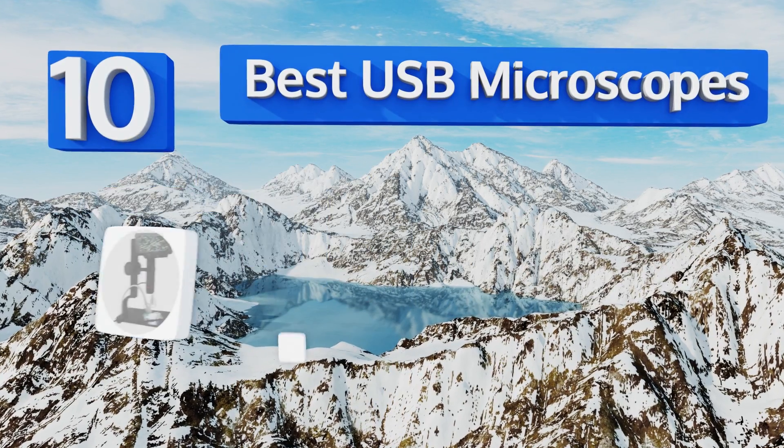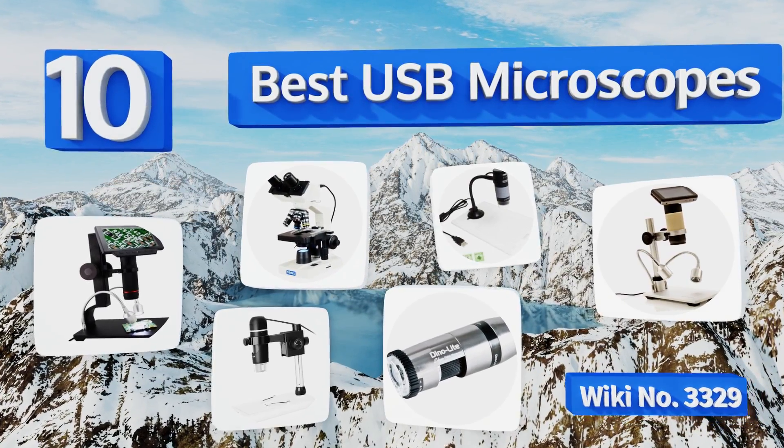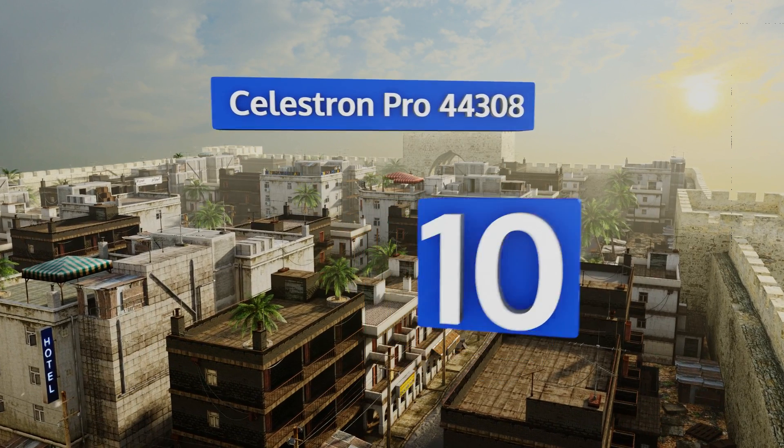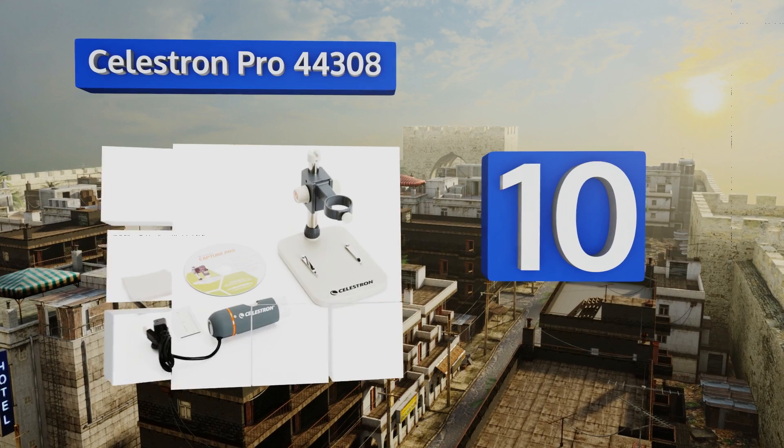EasyVid presents the 10 best USB microscopes. Let's get started with the list. Starting off at number 10, you can hold the Celestron Pro 44308 in your hands for viewing large objects.